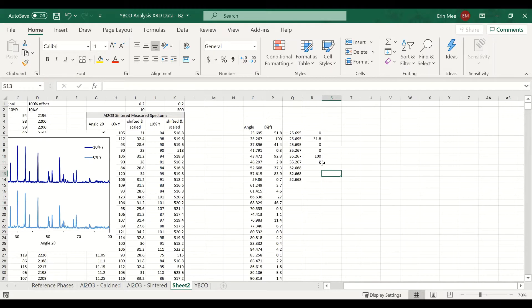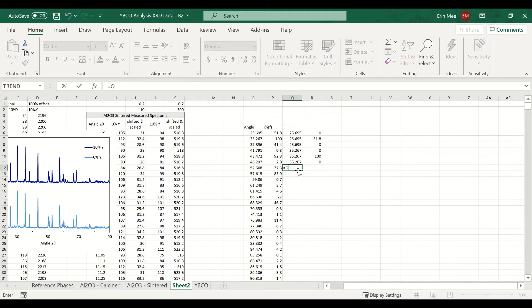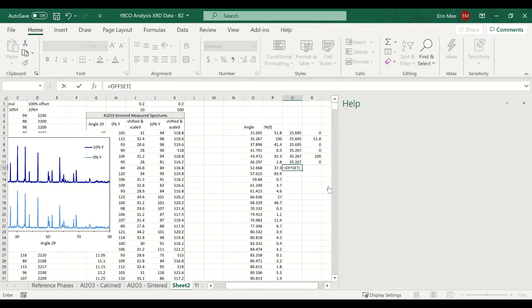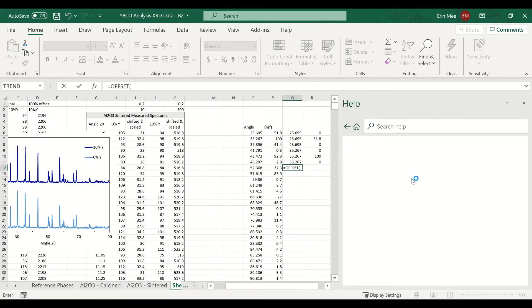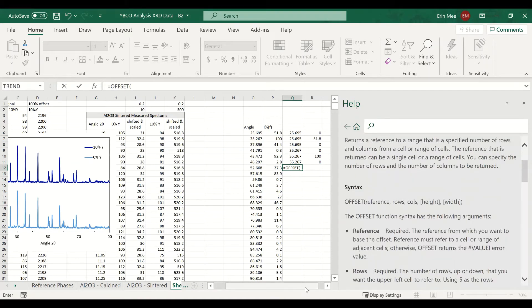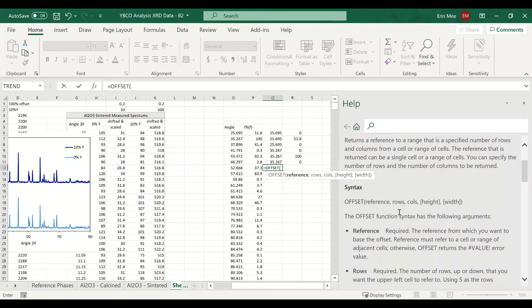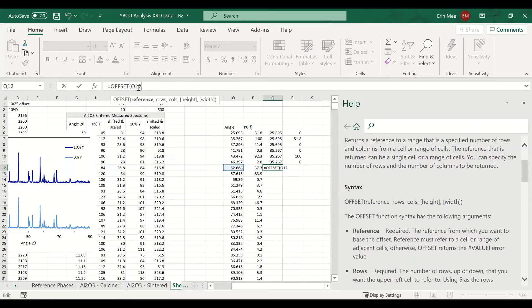Instead, I'm going to use a function called OFFSET. If we bring up the help for it, it uses a reference cell and returns a cell that's a certain number of rows and columns away from that reference cell. I'm going to reference the cell right across from it, and then I need a value for the number of rows — which increases in a periodic way.